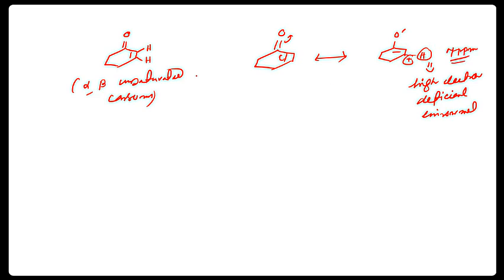So being an alkene, we could expect it to come around the 5.5 region, rather it is appearing in the 7.7 region. So these kinds of things that we have been told or read in books, that there is this kind of delocalization, you can also get from NMR. The NMR value tells that this proton is attached to an electron deficient carbon atom, and that electron deficiency is coming from the delocalization.